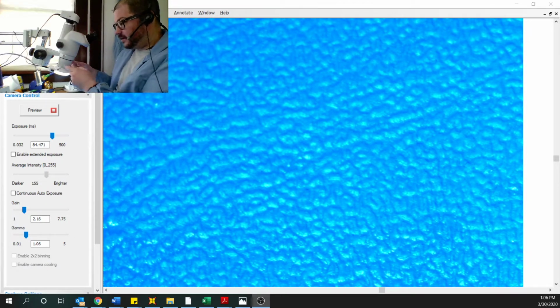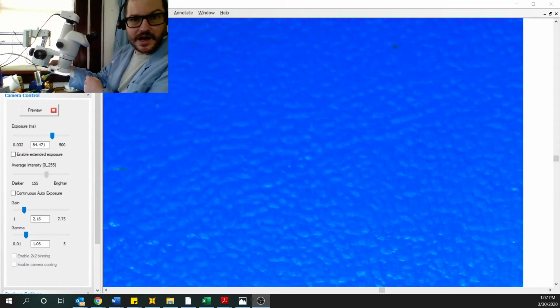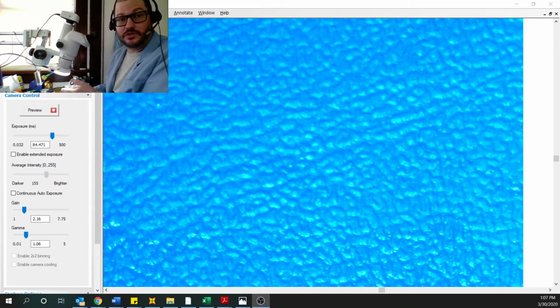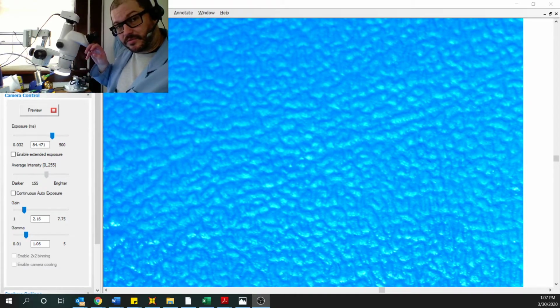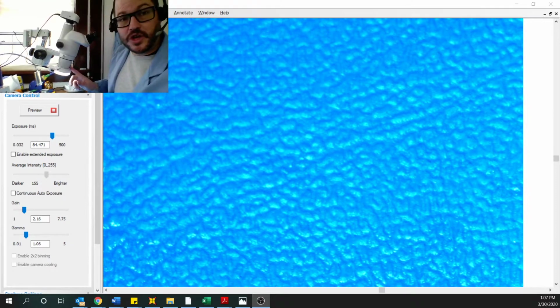Now, the final lens that's actually down at the bottom where my ring light is, this white little guy right here is called a ring light, and I can turn the ring light on and off to increase the level of brightness up at the top of it. Some microscopes actually have a light on the bottom that's used for looking at things like slides, which can be useful. Some of the things that I work with in particular require more light from the top to be able to see, since I'm more of an electrical person and I work with electronics underneath the microscope. Speaking of which, let's put something underneath what we call the objective lens.